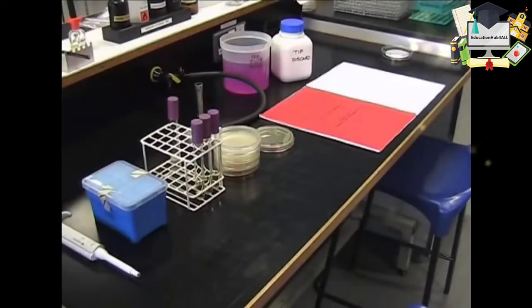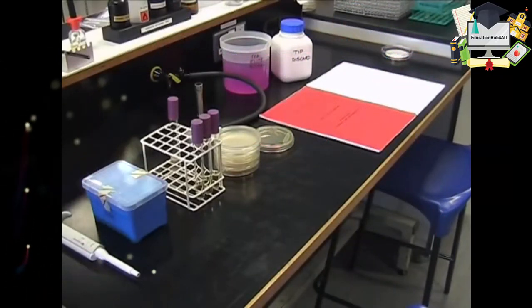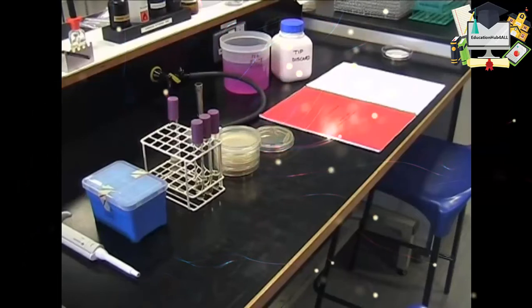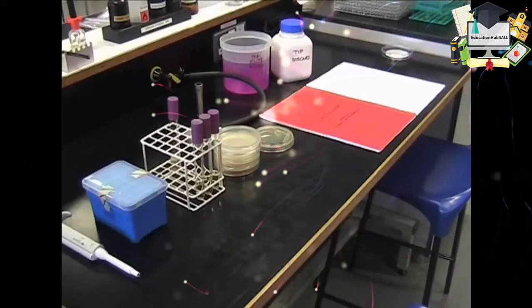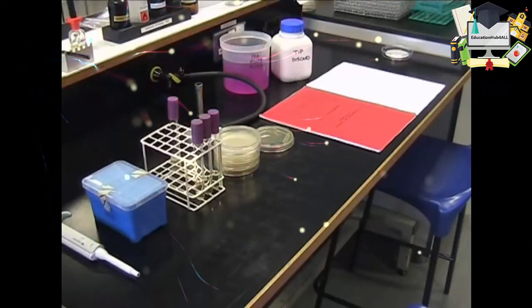The labs will be laid out with all the equipment and materials you need for the exercise you're going to do. For example, here you can see we've got an automatic pipette and sterile tips, some liquid broth cultures, some empty broth tubes, some plates, and a plate culture.